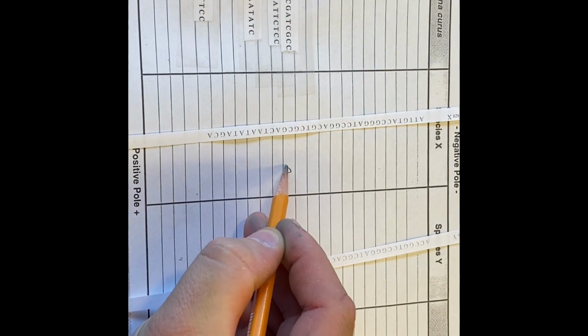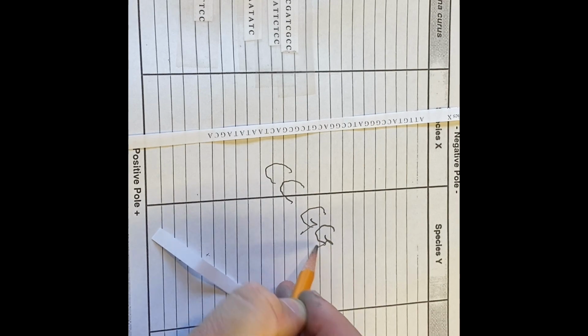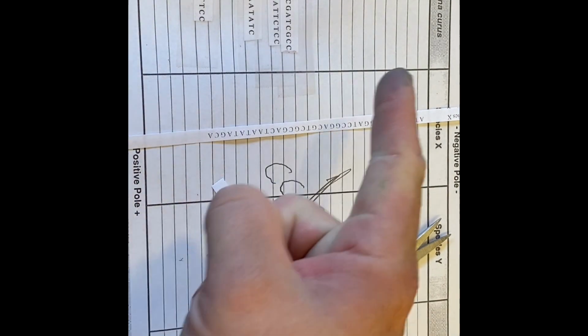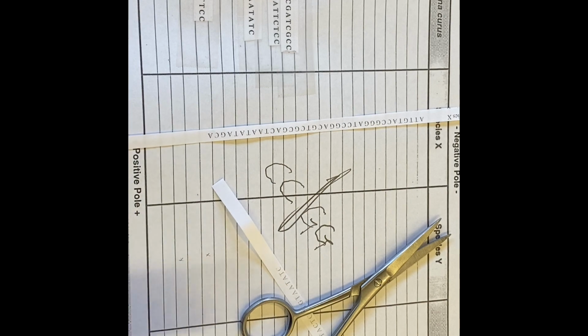Remember, wherever there's 2 C's and 2 G's, you cut it right here. And you cut it once again with your restriction enzyme. Tape them in the appropriate columns. And what you're going to, or excuse me, I'll call them lanes, what you're going to see is something is going to match most closely with Botana. Okay. That is it for the gel electrophoresis DNA banding pattern test.